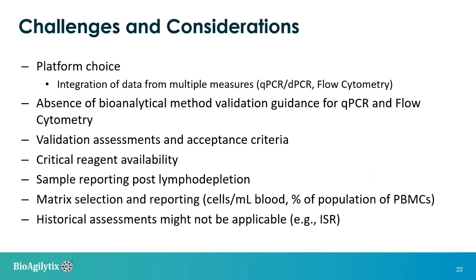Another challenge is that prior to cell therapy infusion, patients are typically lymphodepleted, which can cause hurdles with sample analysis with low cell number counts, and it causes some challenges with data reporting.